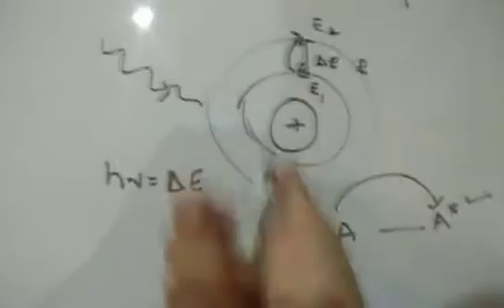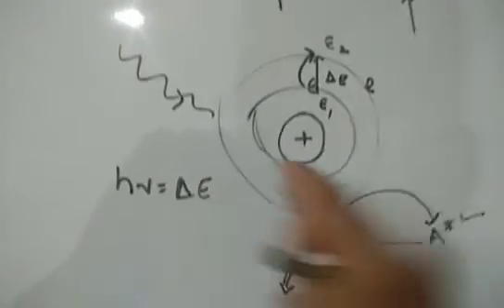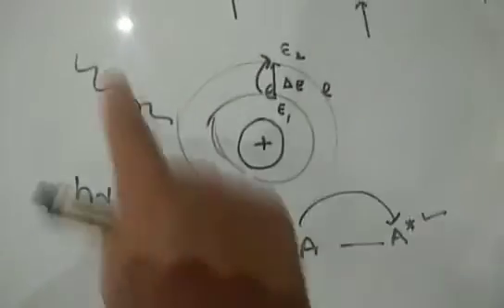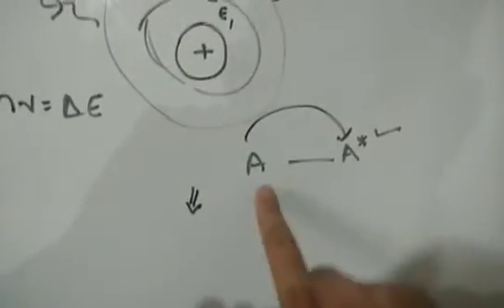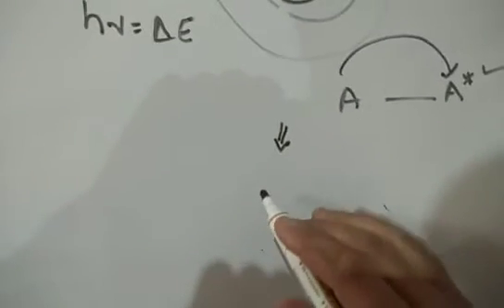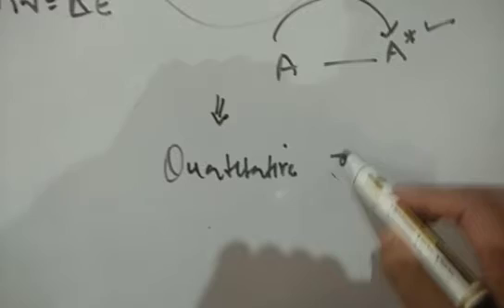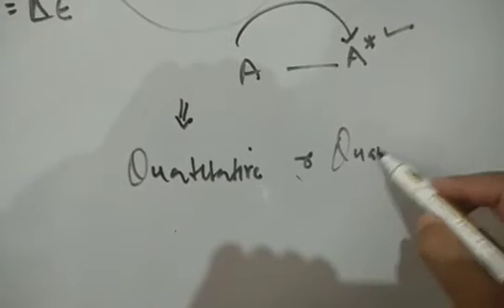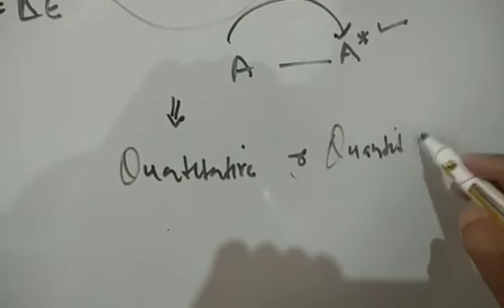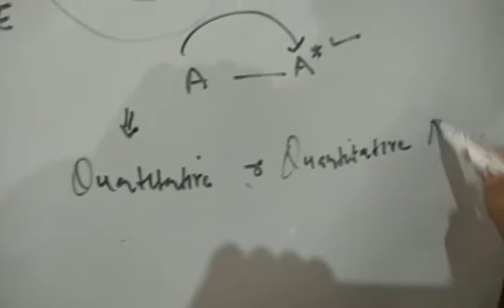So this phenomena of interaction of electromagnetic radiation with the atoms, remember यहाँ मैं दोबारा discuss कर रहा हूँ with the atoms, not molecules. Now if this condition is matched, then the electronic excitation takes place. So this phenomena results in the conversion of atom from ground state to the excited state. This conversion is utilized for qualitative and quantitative analysis. अब क्या मतलब इसका qualitative and quantitative analysis?